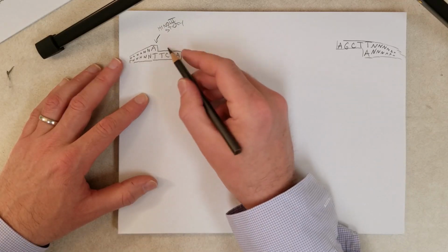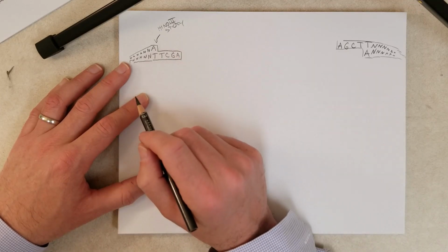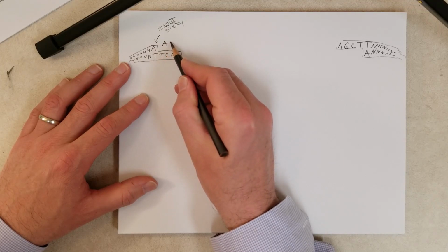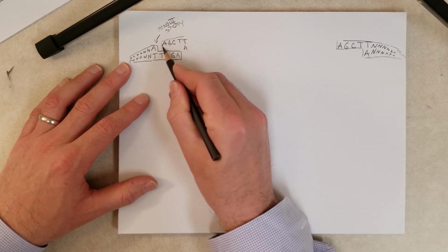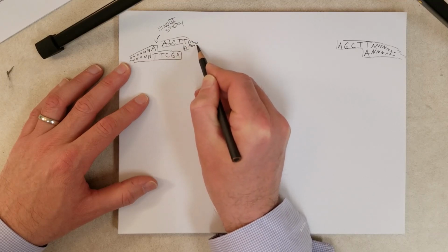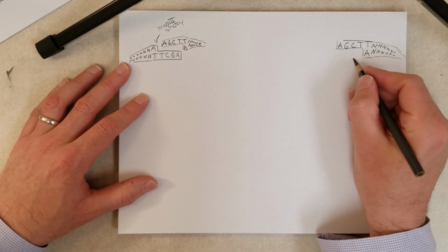Now the insert, okay, we want to get that insert ligated into here. And remember, the insert also has HindIII sticky ends. So let me put the insert like right here. I'll start with this end. And same thing, I'm zooming in on one of the sticky ends of the insert, and then I'll do the same thing over here.